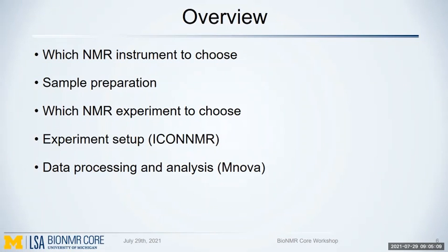And then I'll give some tips on sample preparation. And the major part of the workshop will focus on the NMR experiments. We will go through the 1D and 2D NMR experiments available one by one, and then you will know which NMR experiment is best for your compound. And then we will set up some of the experiments on ICON-NMR. And after that, if we have some time left, I will cover data processing and analysis with the software called MNova.